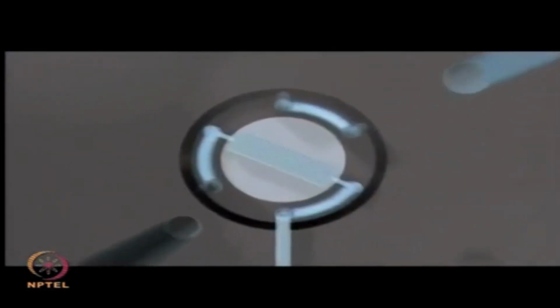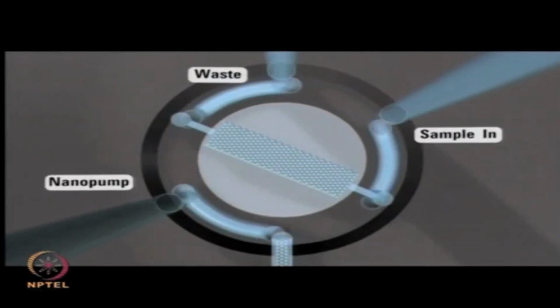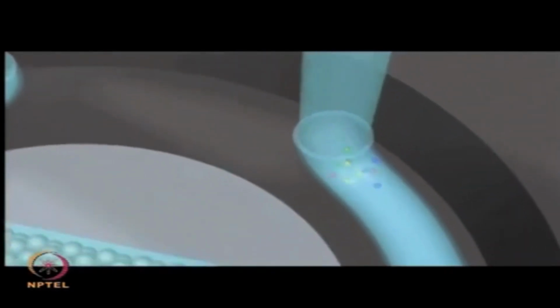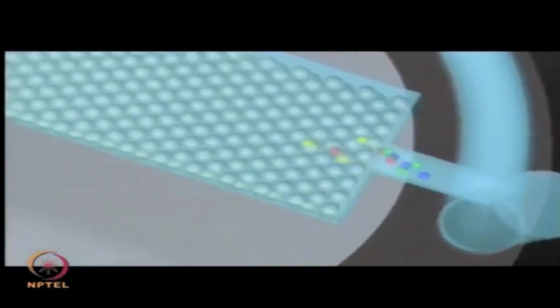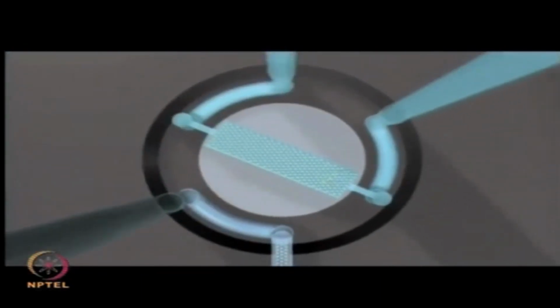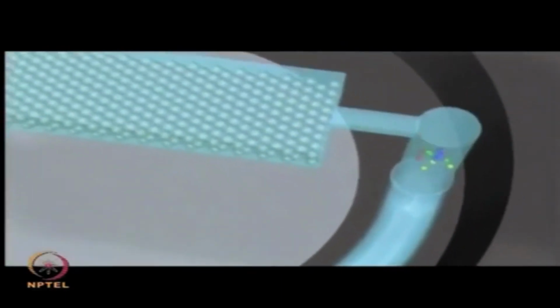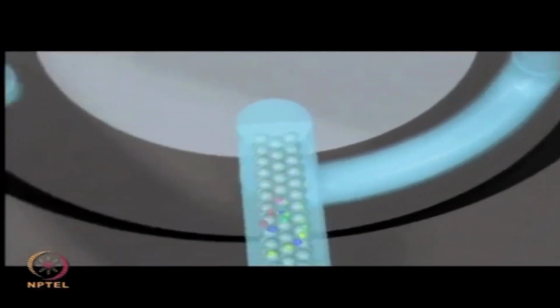Let's look at how the Agilent 1200 series HPLC chip MS system can be applied to a typical protein identification analysis. The Agilent micro-well plate autosampler loads the digested proteins. The solvent flow moves the peptides into the trapping column. The microvalve changes the flow path. The gradient flow from the nanoflow pump takes the enriched sample from the trapping column to the separation column. The peptides are separated just like on a conventional nanoflow column.